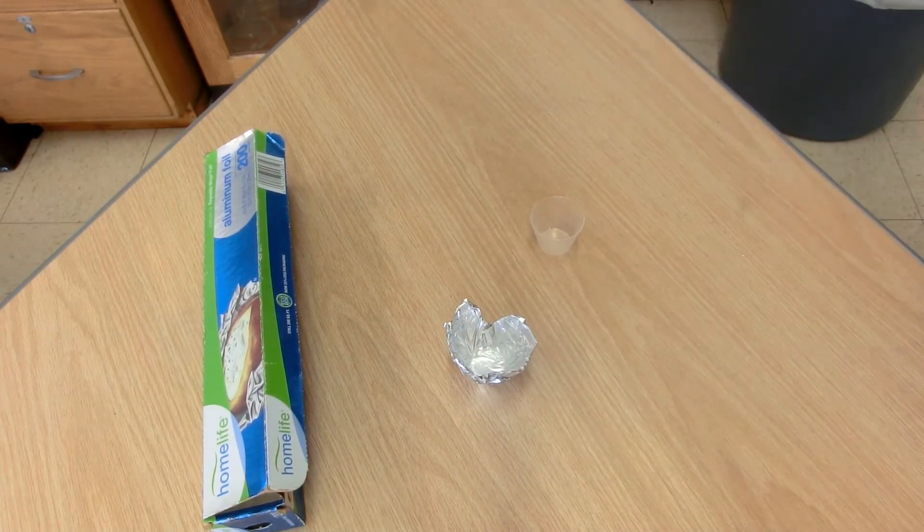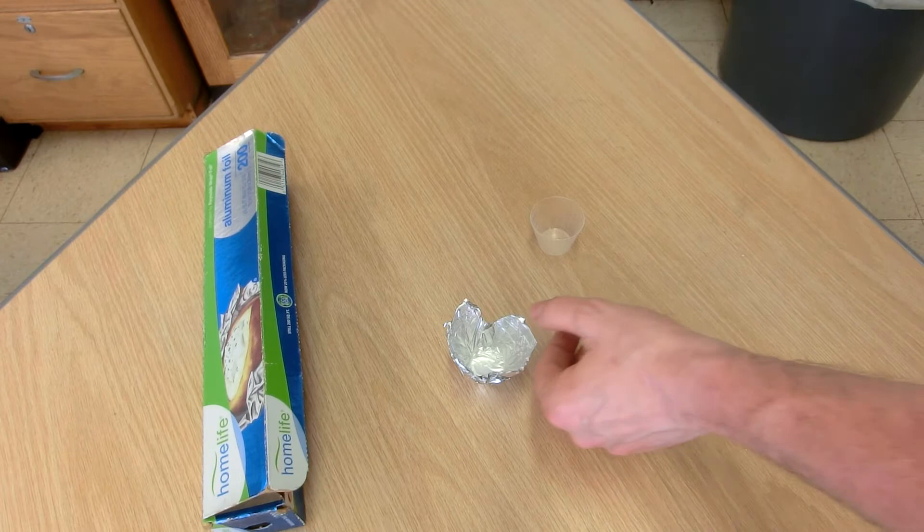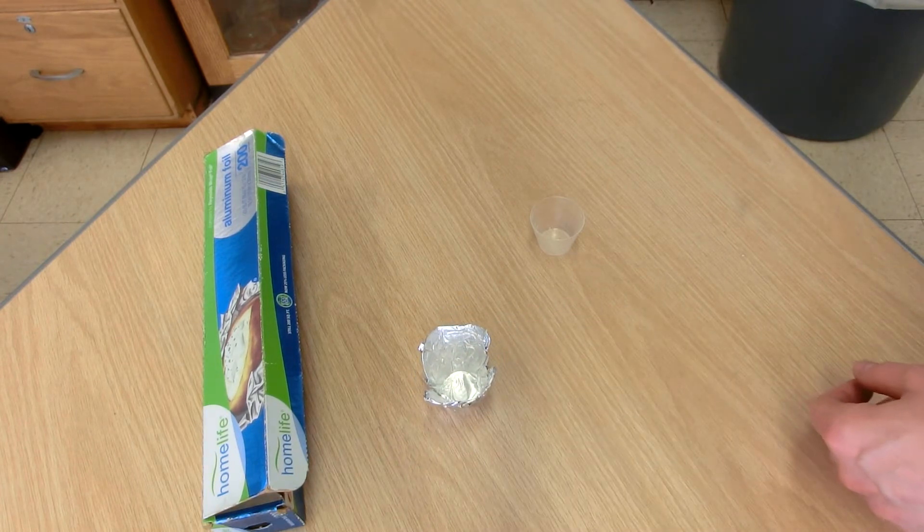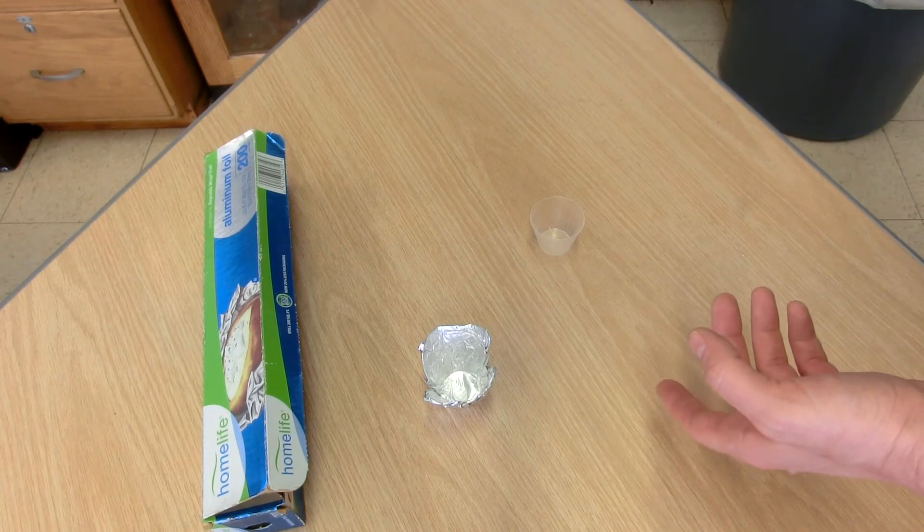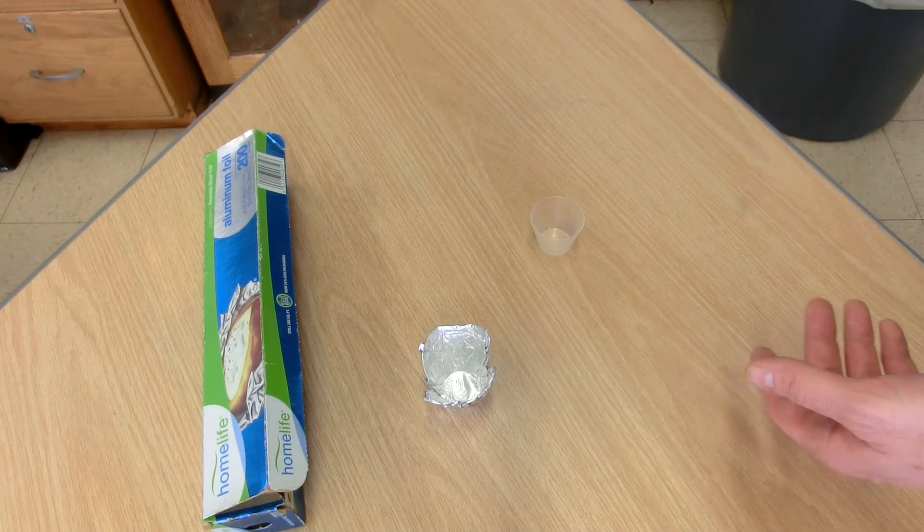It has a flat bottom so it can sit on a hot plate. I would not use this with a Bunsen burner because aluminum might melt in the flame. Aluminum has a melting point of around 660 Celsius, and Bunsen burner flames can get that high, so it could melt the aluminum directly.